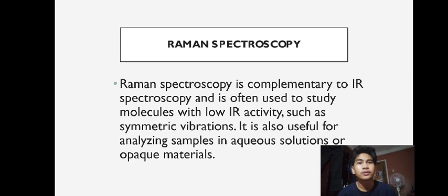Raman spectrometry is complementary to infrared spectrometry and is often used to study molecules with low infrared activity, such as symmetric vibrations. It is also useful for analyzing samples in aqueous solutions or opaque materials.